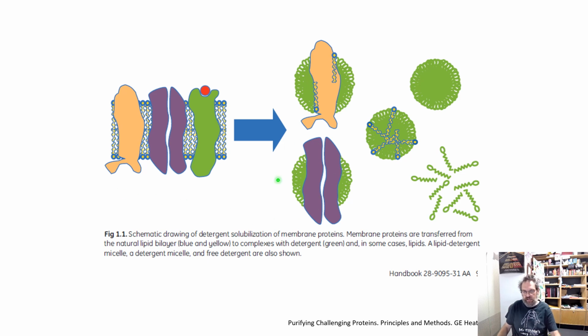This is just reiterating the same thing where you've got your surfactant molecules and they interact with the external surfaces of the protein, but they can also interact with the internal surfaces of the protein and open them out to be able to get more molecules absorbed. You can go too far. You can have too many surfactant molecules.